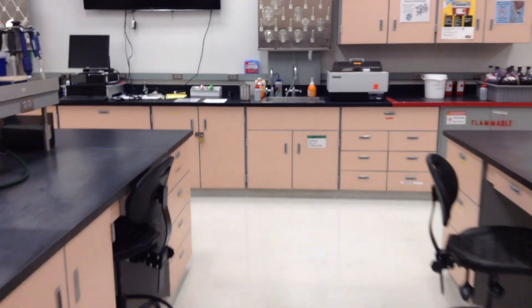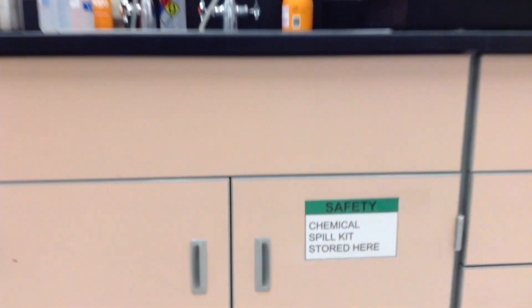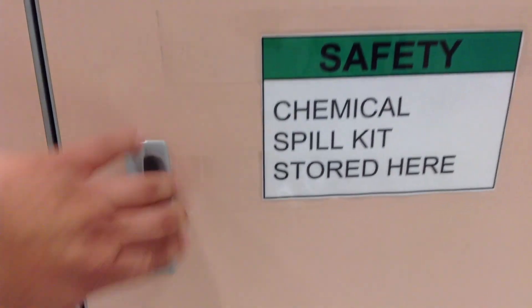The chemical spill kit in room B65 is also located under the sink. Once you enter the main door to room B65, make your way towards the computer screen and you will find the sink to the right of the computer screen.